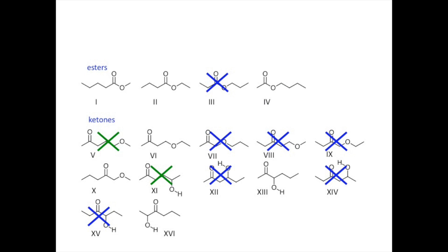Let's look at structure 2 again. If we ionize at the carbonyl oxygen, we can have a radical site-initiated cleavage, giving rise to the loss of C2H5O. The charge remains on the fragment that weighs 71 atomic mass units. We might also imagine a net loss of 45 through another pathway.